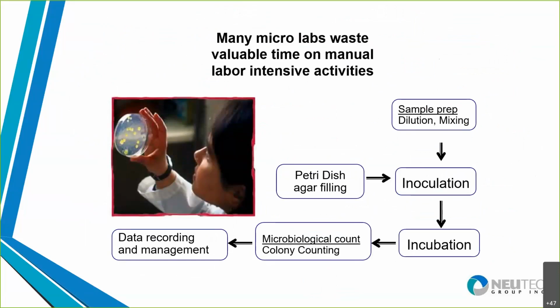And the traditional or manual ways of doing these types of tests have been around for years. But they tend to be fairly laborious, time-consuming. You need some effective training to be able to do it well. And so there's a lot of challenges associated with trying to manage and run a microbial testing laboratory. There's the process of sample prep and setting up and doing your dilutions and making sure you're doing those correctly and weighing things correctly and mixing the right way.